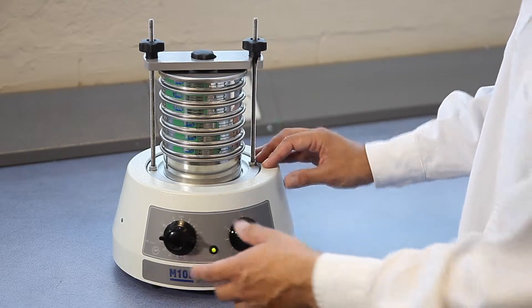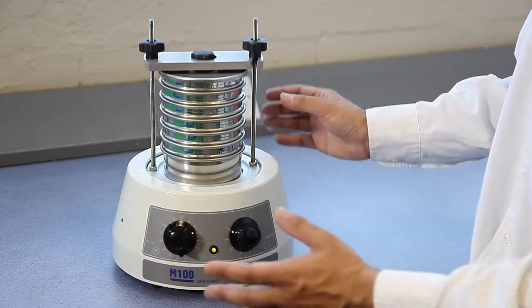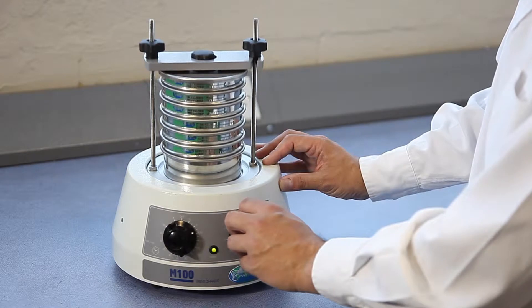It's very easy to operate. You have the timer, but also additionally with this machine there is an amplitude control.